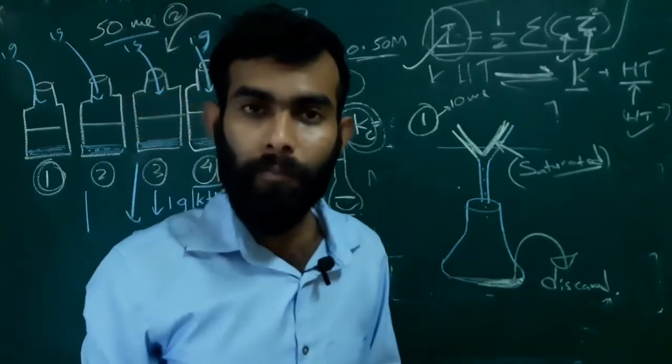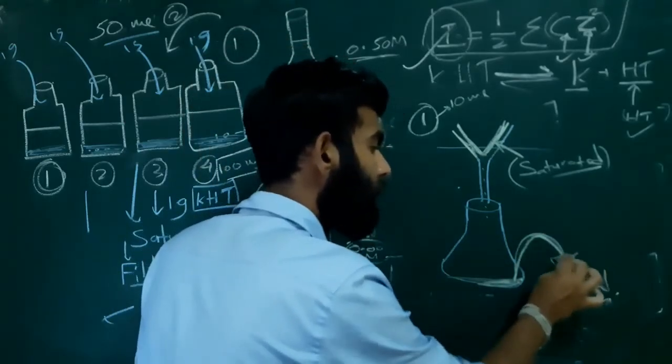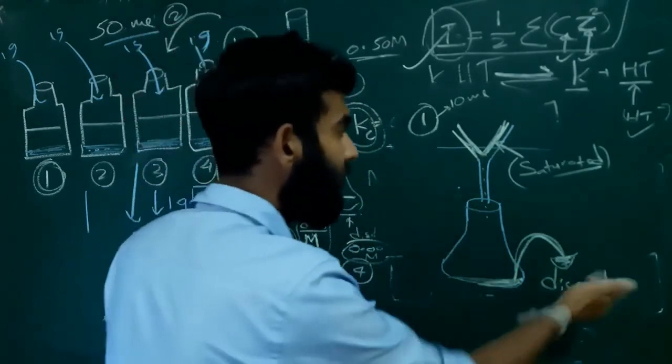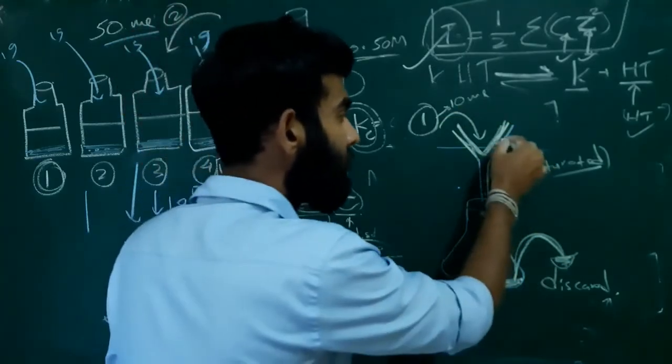Because of that, we will discard the first 10 ml, and after discarding, now we can filter the whole solution because the filter paper is saturated.